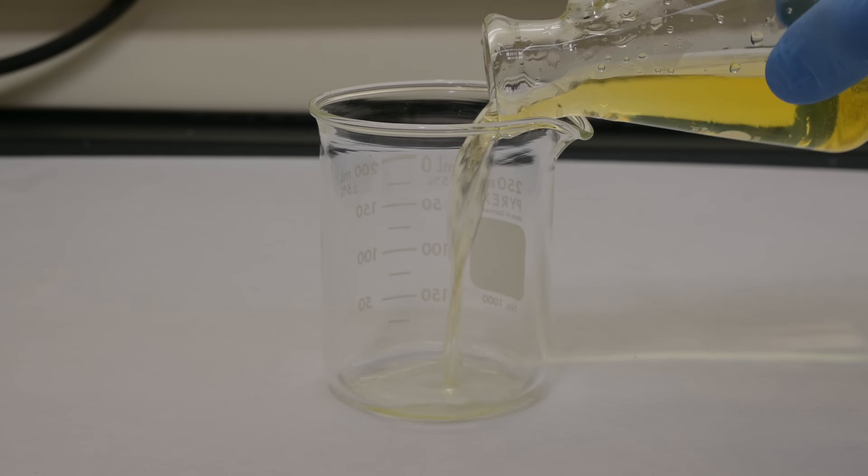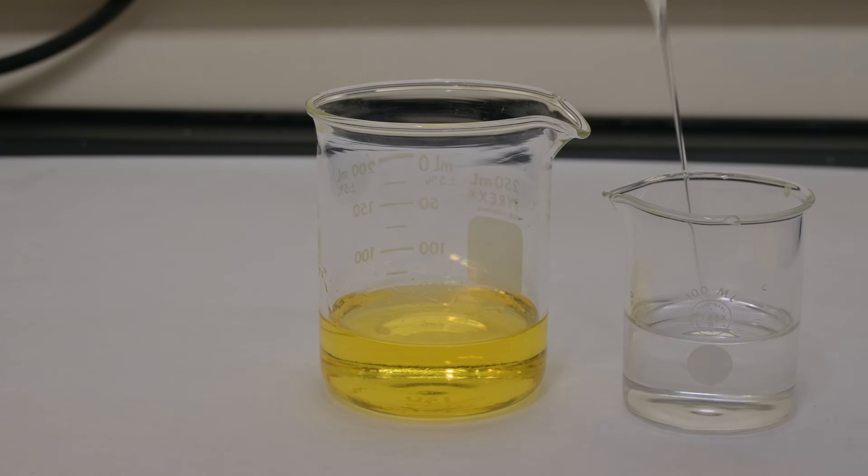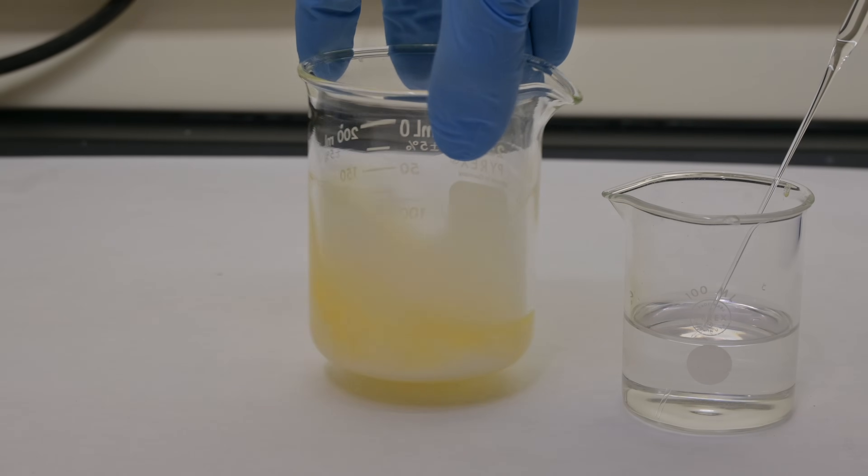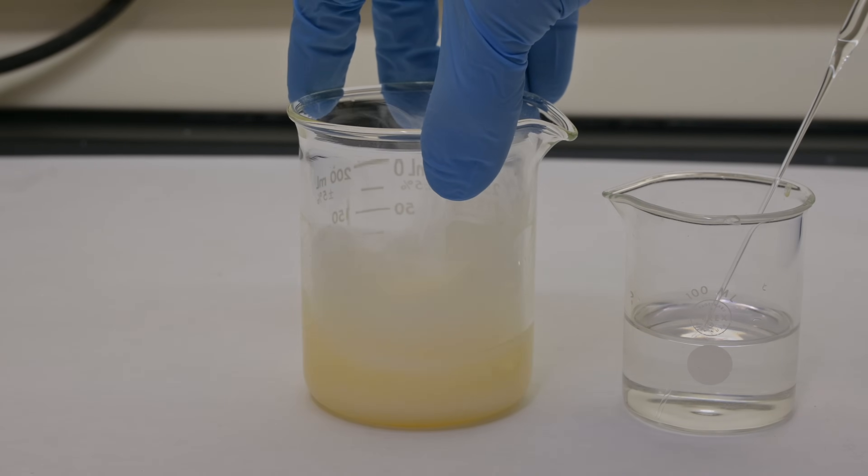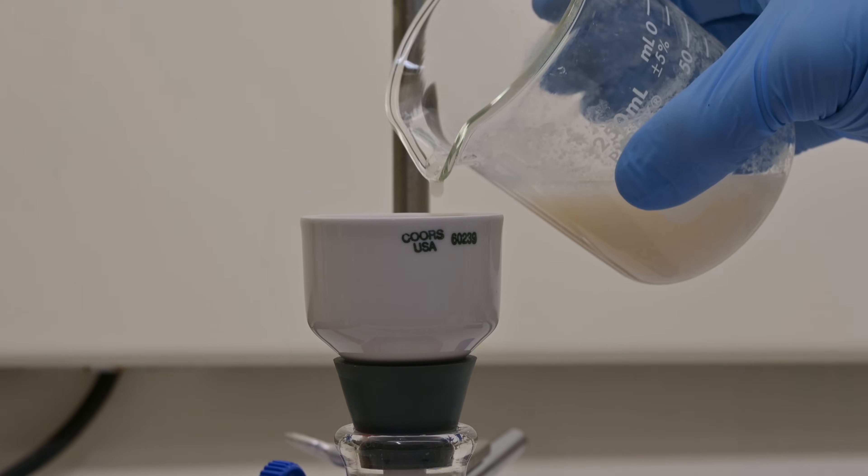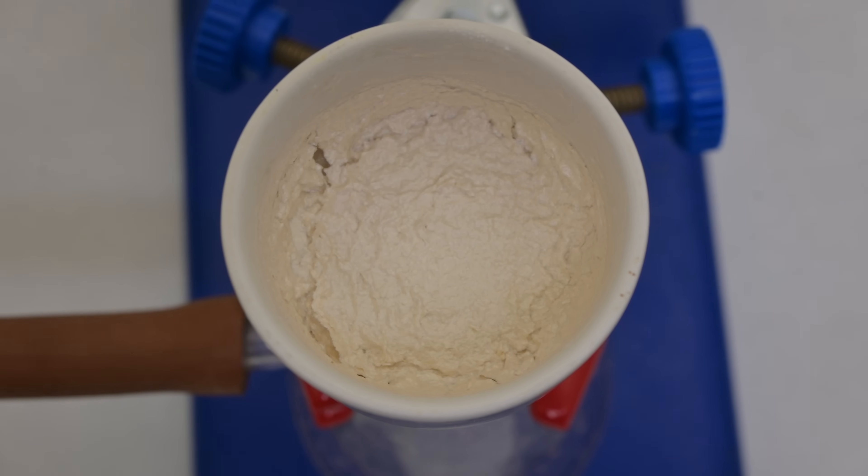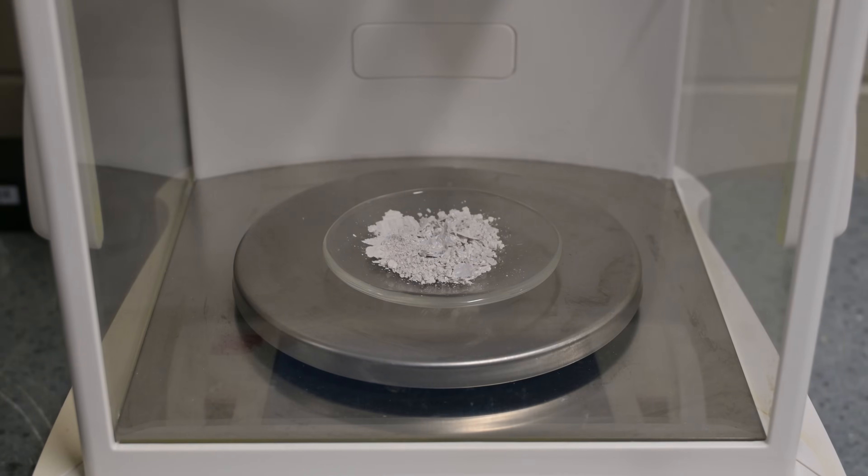Following the filtration, the solution remains basic and contains our hydantoin intermediate, dissolved within it. To isolate the desired Dilantin, we acidify the filtrate carefully by adding dilute hydrochloric acid until the pH drops significantly. Acidification protonates the intermediate, dramatically reducing its solubility in water, causing it to crystallize. These newly formed crystals are then isolated by filtration and washed with cold water to remove any residual impurities, and we're allowed to dry. Our yield at this point, however, is just under one gram.